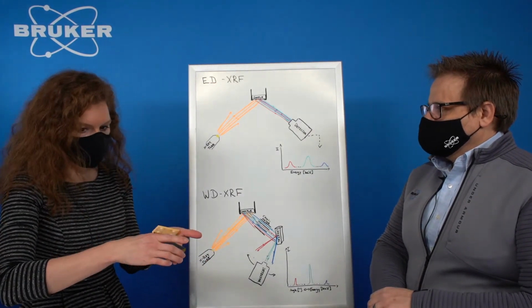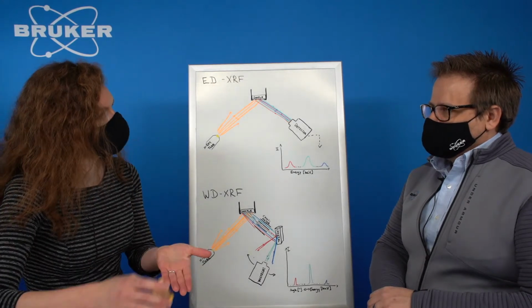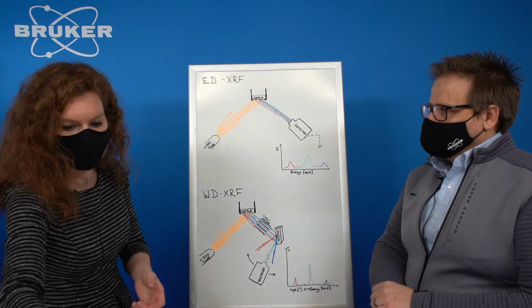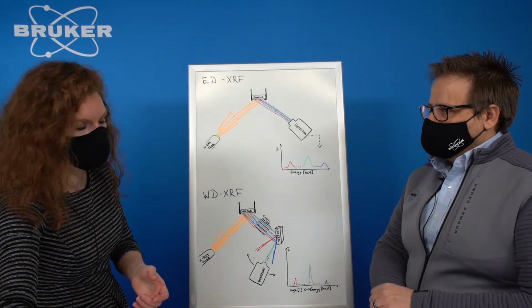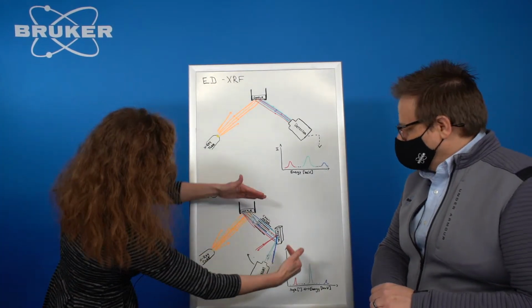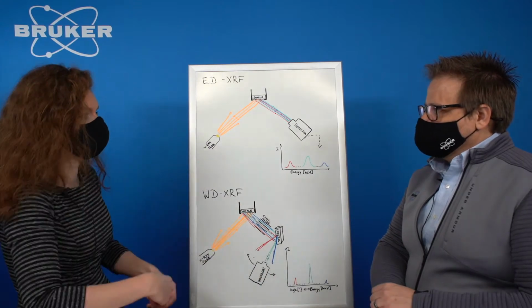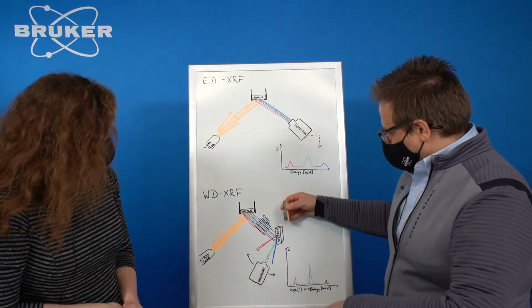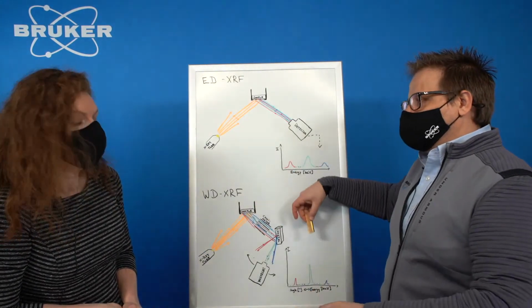So because the periodic system is very big and we do have a lot of energies to look at, it's better to use different crystals because we only have a finite space where we can reflect off to. So then with a machine, would I have to stick in this one if I'm expecting heavier ones, and then take this out and stick another one in if I'm looking at the other elements?